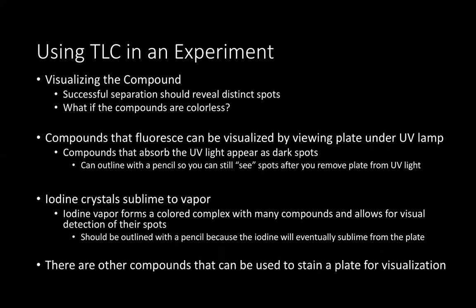The final stage of TLC is visualizing the compound. As we've seen in some of these illustrations, successful separation of a mixture should reveal distinct spots. Things to think about: what if the compounds are colorless? You're spotting this on, you see it when it's wet, but once it's dry, you can't really tell that there's anything on the plate, at least not to your naked eye, without any kind of assistance.